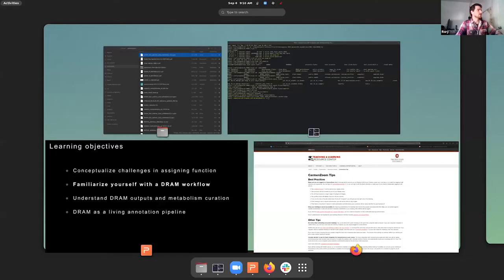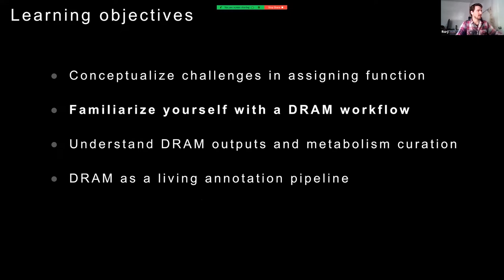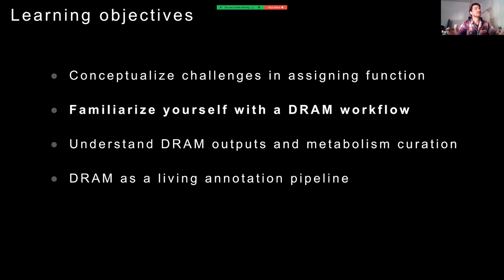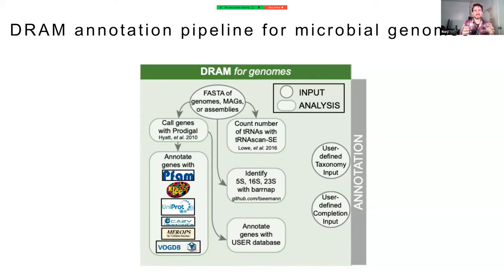Excellent. All right, so thank you, Michaela. That was excellent, perfect execution of the cookie metaphor. I'm going to be familiarizing you with our DRAM workflow. The workflow of DRAM is actually filled with nuance, but the overall is not that complicated and pretty straightforward to understand. You start with your FASTAs of genomes or MAGs. You call your genes in this case, and then we annotate those genes with a selection of databases.